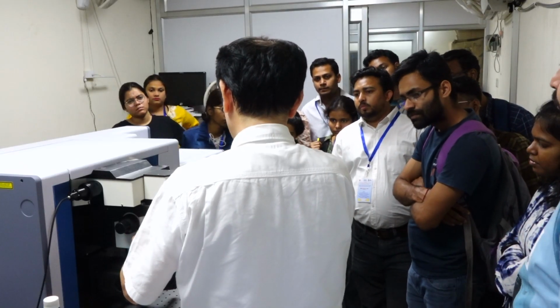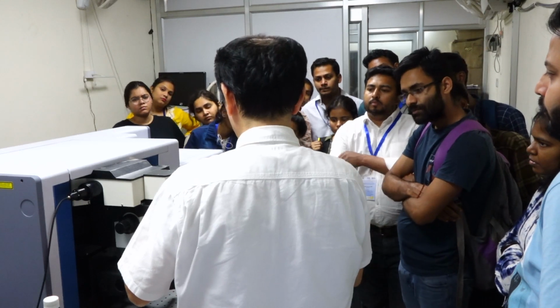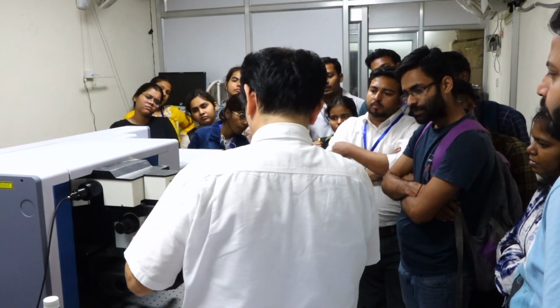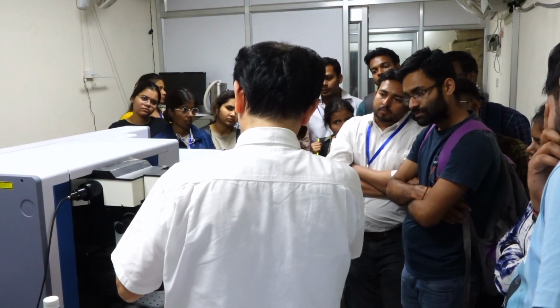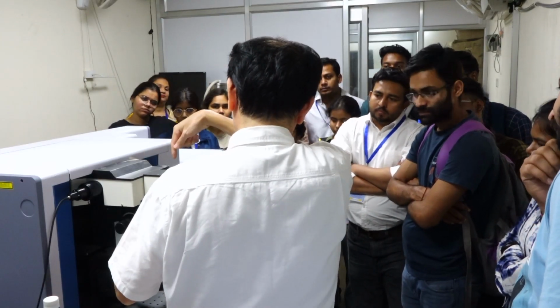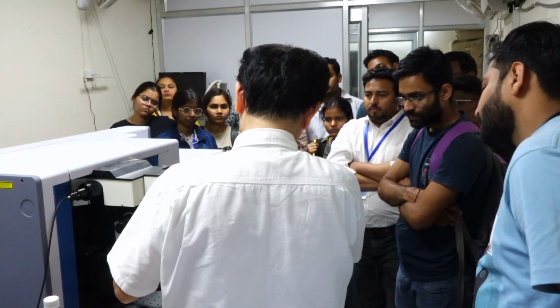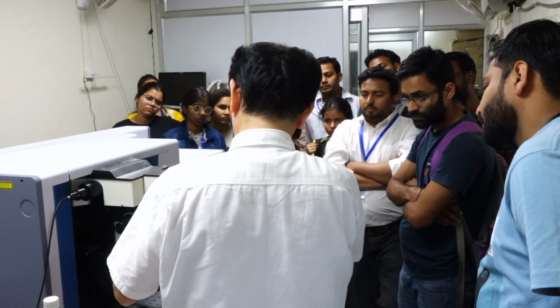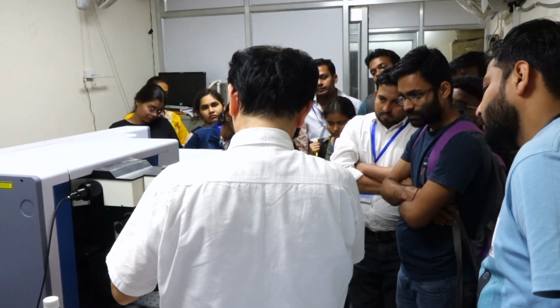So exactly speaking, today's measurement is not a Raman microscope measurement. You see, here is an attachment, and the laser beam comes from the top, and it is reflected by this mirror and passes through the focal lens. It is focused on the cuvette.